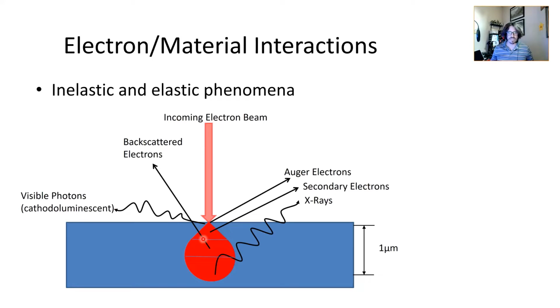On the XRD, you're in the milliamp range. On a SEM, you're around the microamp range. Okay, so you're 10 to the negative 3 on an XRD X-ray generator, and 10 to the negative 6 in a scanning electron microscope. So remember that: 3 orders of magnitude lower beam current on a SEM. That being said, you still have heat.